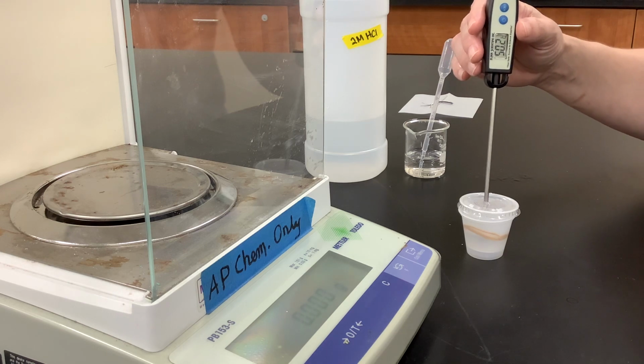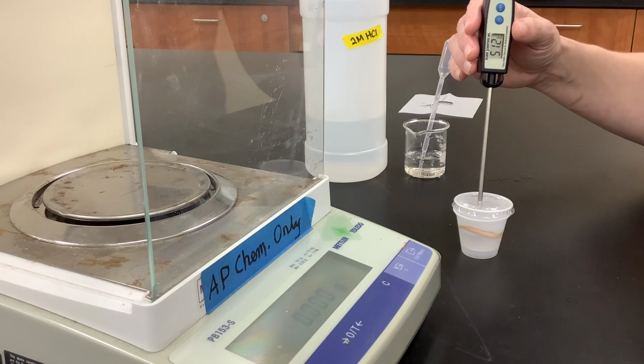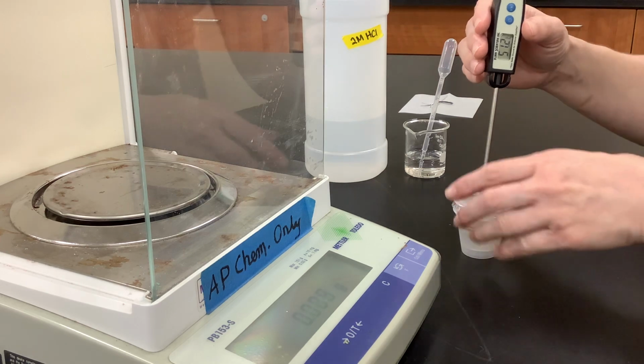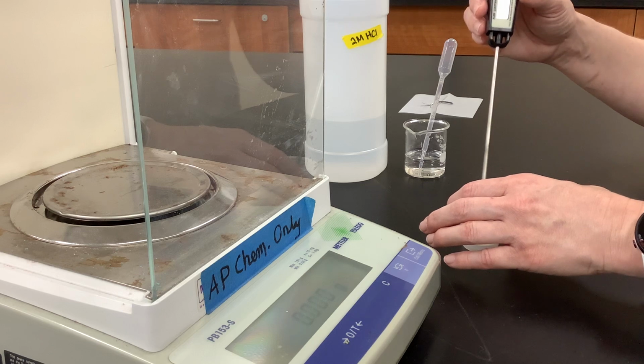It's quite warm to the touch, which is definitely another indication of reactions and temperature changes, besides just the bubbling. It looks like we're starting to slow down. All right, it looked like about 51.3 was the highest that we reached in terms of temperature. So this would be trial number 1.